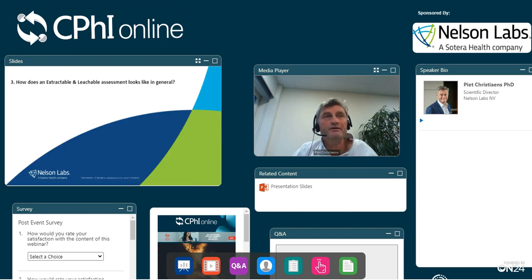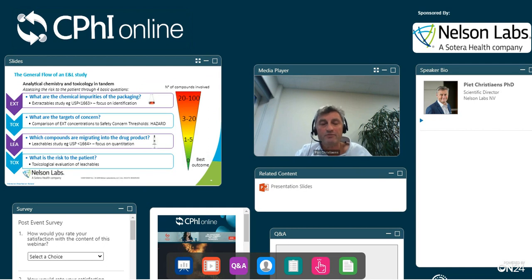So what does an extractable and leachable assessment look like in general? We're not talking specifically about lyophilized drug products, but more, for instance, the general category of small volume parenterals. In a first step, after a careful evaluation of your materials of construction, you design an extraction study based upon what you know about the components, the materials of construction, and the physical-chemical properties and composition of the drug product. This may be reflected in the experimental conditions, such as the selection of your solvents. pH can play a role, the time and temperature during the extraction, or the stoichiometry, for instance. This is something that you can find in the USP 1663 on how to design your extraction studies.